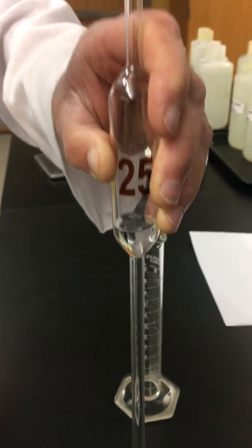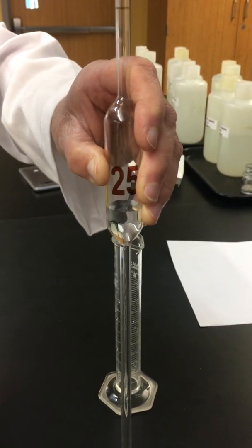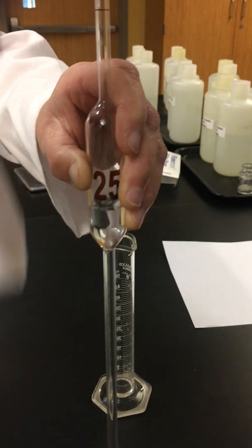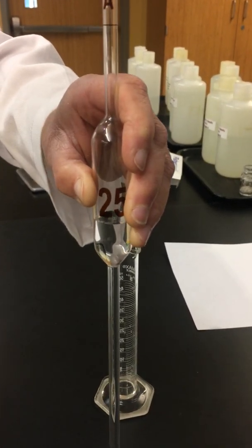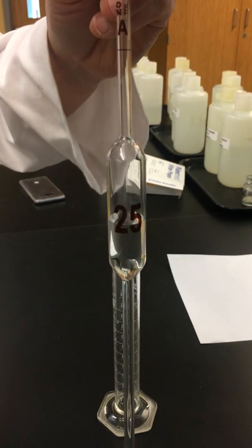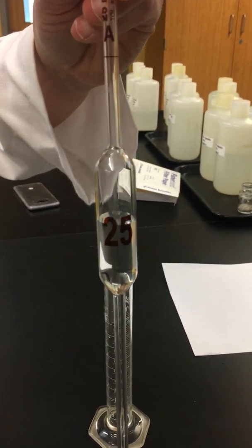We want to always make sure we're avoiding pulling liquid up into the pipette aid because that ruins it. So now we just keep slowly turning the dial, allowing the liquid to come up as we turn it.